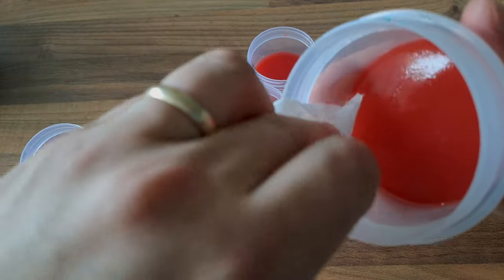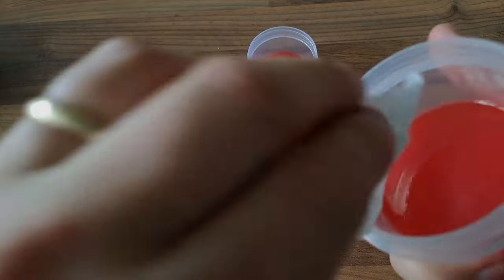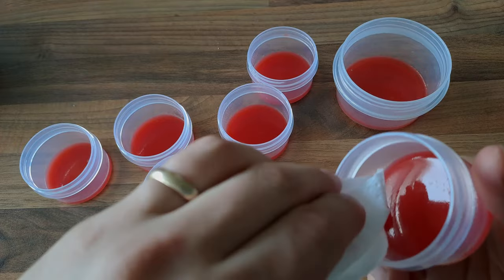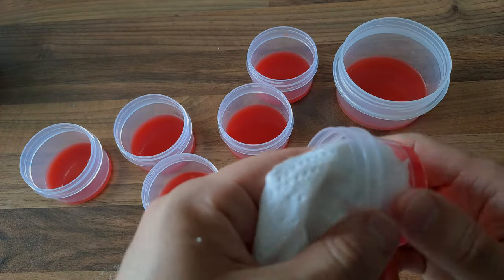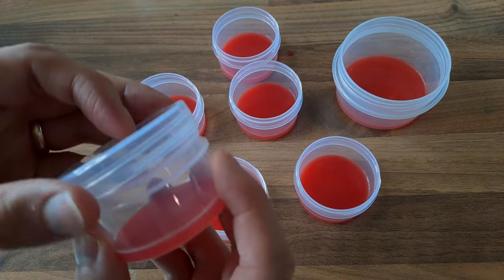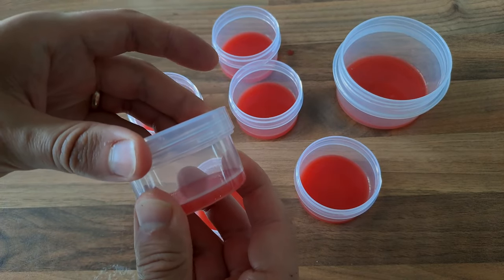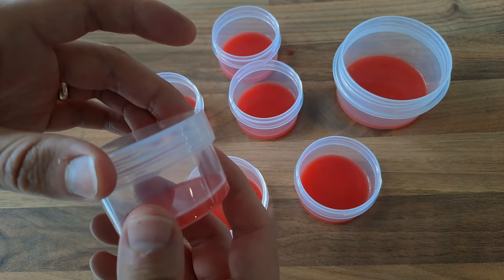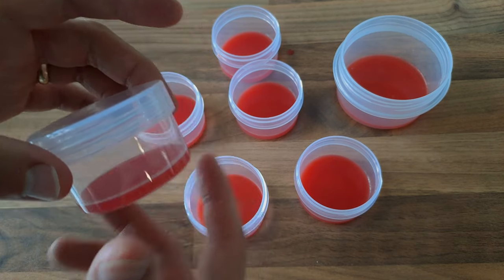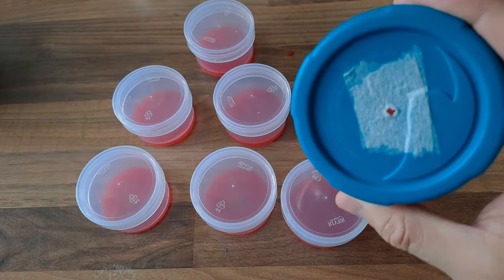I leave the pots to settle for 5 minutes and then I wipe any excess condensation off from inside the pots and put the lids on. If you're using unmodified lids, then tighten the lid up and then loosen it slightly. This will allow pressure to escape during the sterilization process. This will stop the pots from warping or cracking.